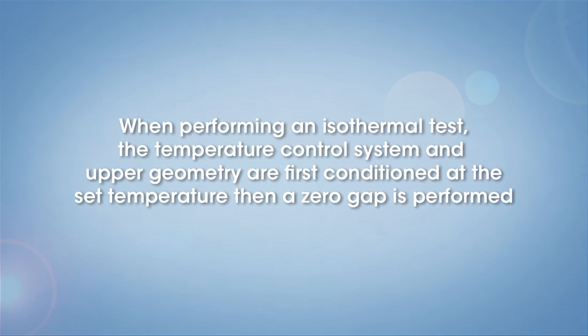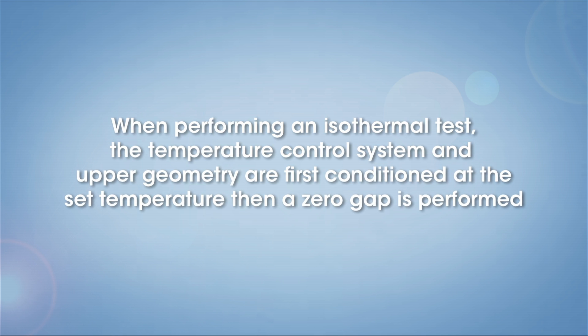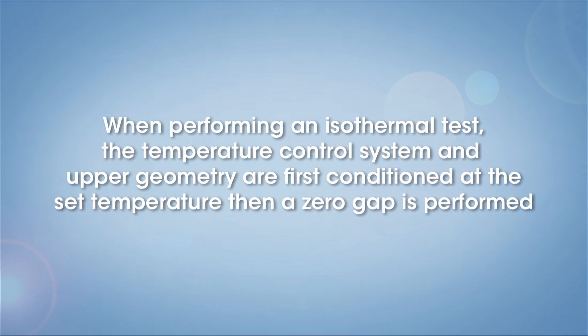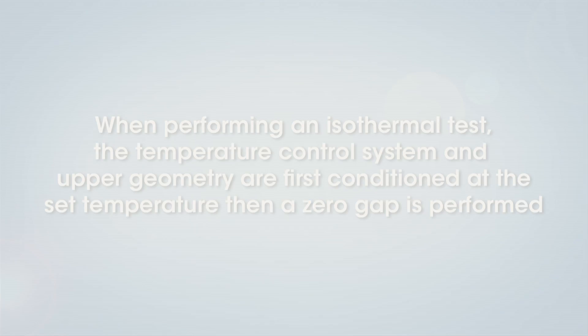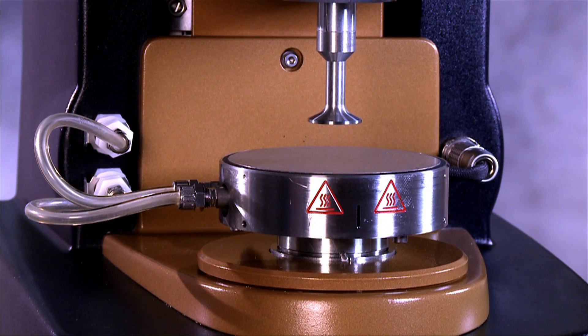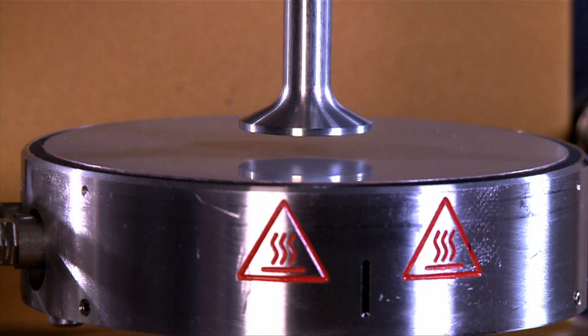When performing an isothermal test, the temperature control system and upper geometry are first conditioned at the set temperature, then a zero gap is performed. The measurement gap for each experiment following is set based on that reference point.